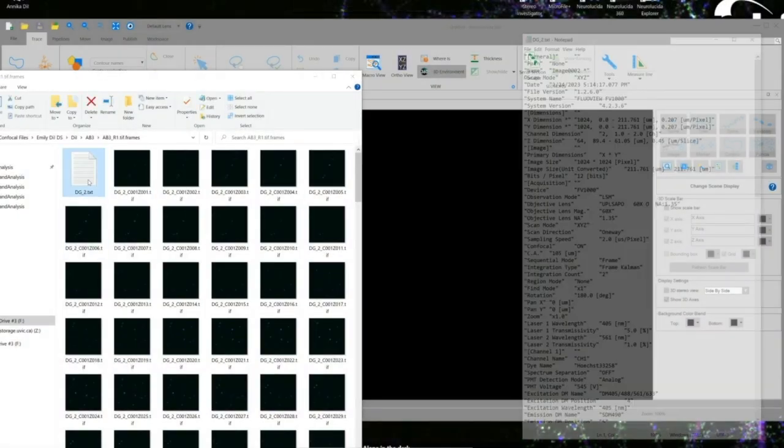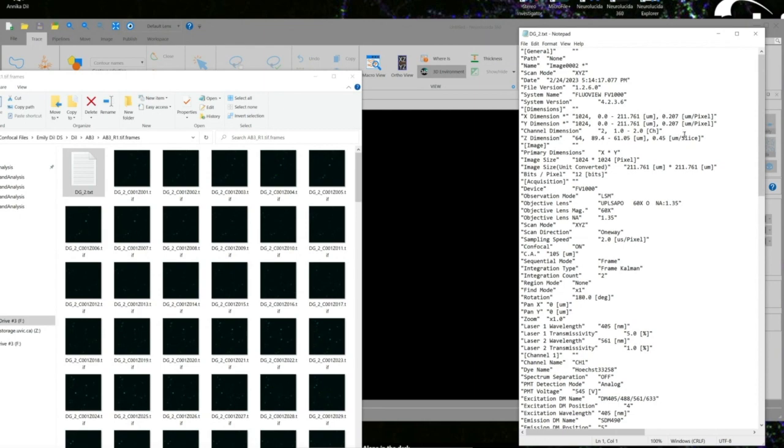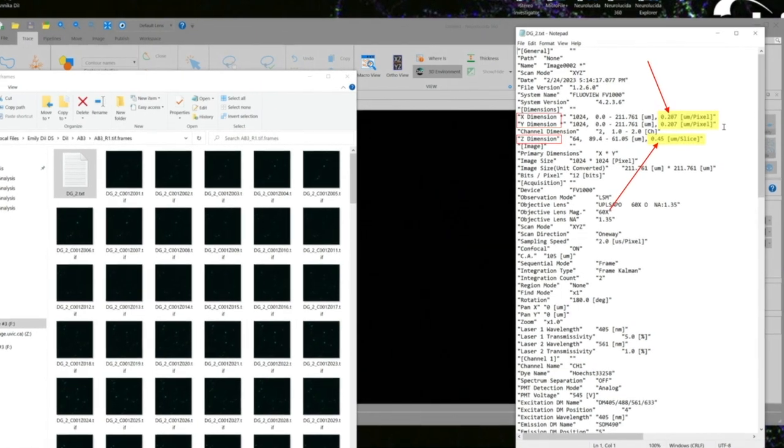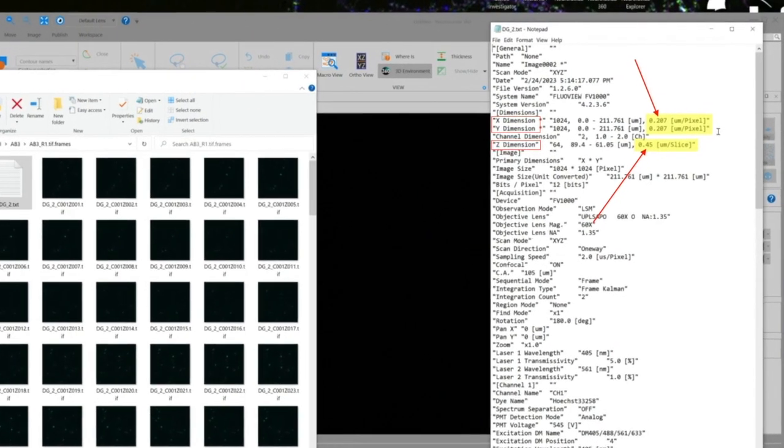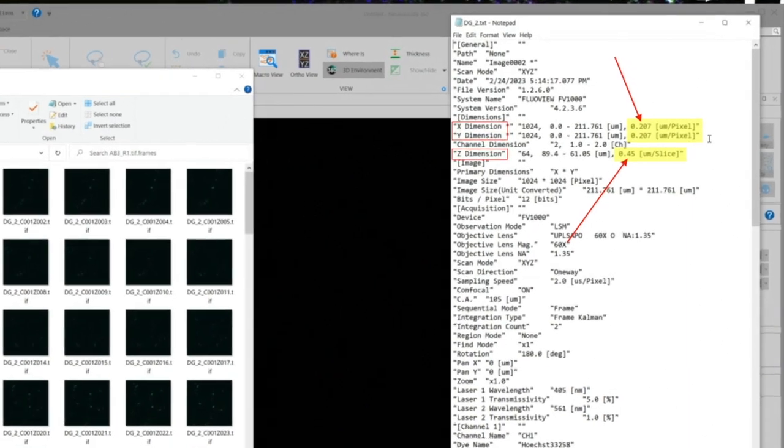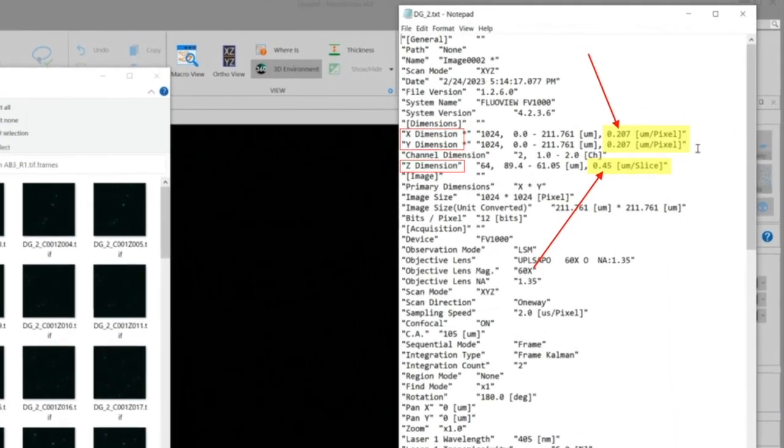Looking at the text file associated with all of our individual confocal image frames, we will make note of the scaling information for the x, y, and z dimensions.